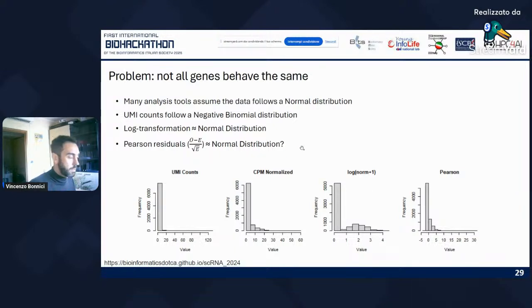It's a very specific statistical way of normalizing, transforming your data such that at the end of this transformation, your data should have the shape that is expected by the statistical analysis that you are performing, because statistical analyses always have some assumptions, such as the shape of the distribution that you are taking into account.